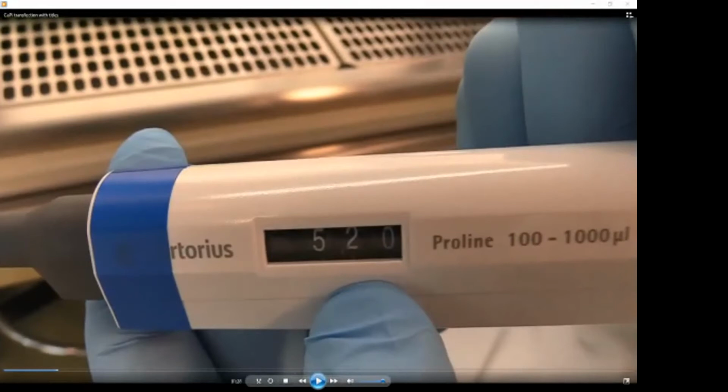Why this volume? Because our experiment contains 4 different samples, and these 4 different samples are always done in triplicates. This technique, if everything works well, is very sensitive, and there are quite large differences between individual samples. For that reason, we always use triplicates, and then for the final evaluation of the results, we make the mean and standard deviation.